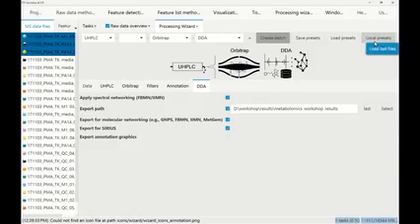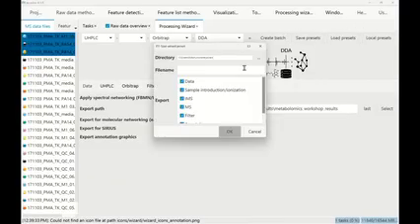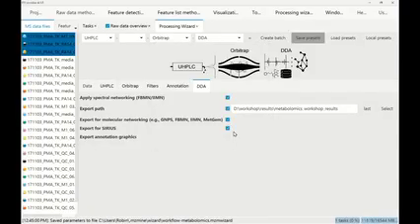So in the future, we want to build up like a database of presets from different people. Like if you publish your paper, you should be able to also basically upload your preset somewhere, and then we're going to find it and maybe add it. But if you save a preset, so this one we could now call it like flow, like it's a whole workflow. So like workflow, metabolomics, like this, and OK.